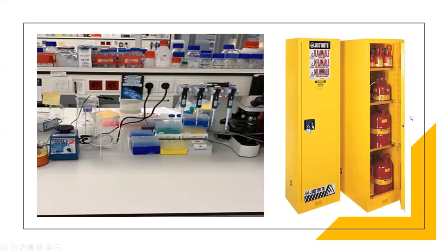So this is just a visual of a flammable cabinet. So in the lab, you may have to use a Bunsen burner, things of that nature. So these would take the place of that. And this is just what I believe to be a proper workstation. Everything is tidy, everything is clean. Your pipettes or things of that nature are readily available. You don't have to run around the lab to find things. They're all right there in your workstation, which creates a flow when you're testing that will help you in the long run.